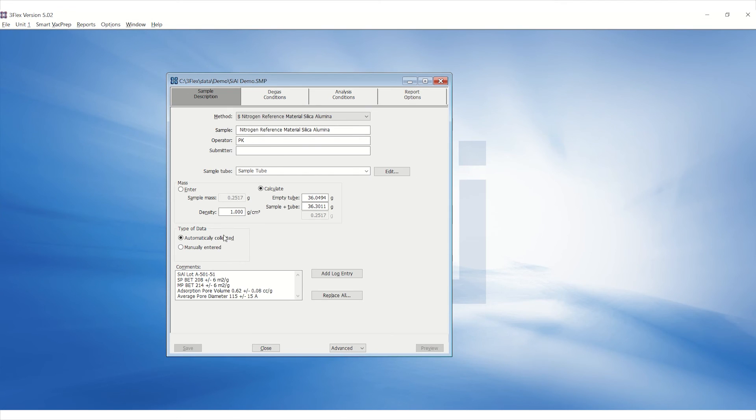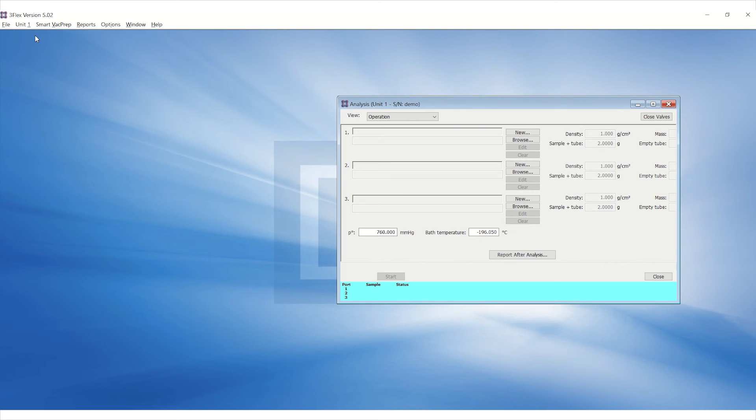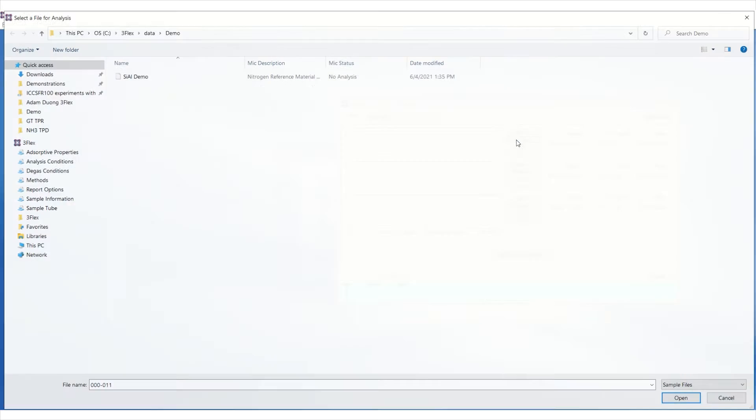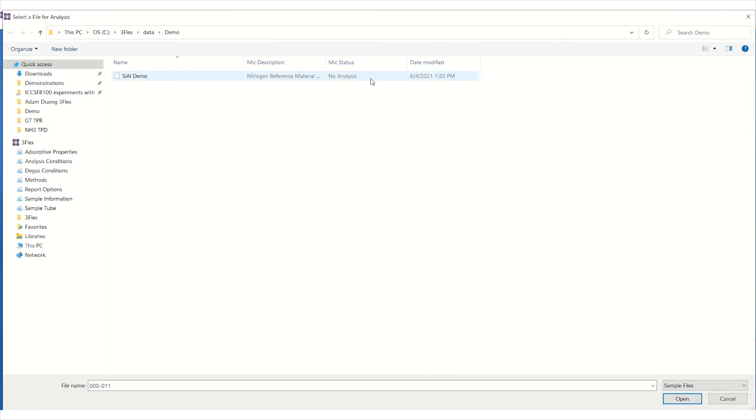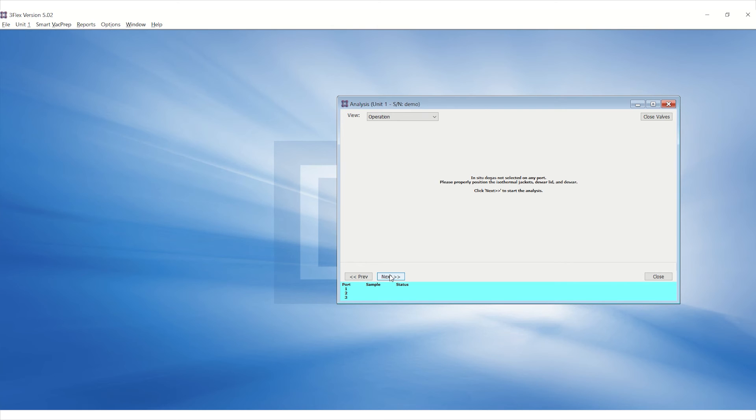To start the analysis, go to the Unit menu and click on Sample Analysis. Browse and select the SMP file on the appropriate sample port. Click Start.